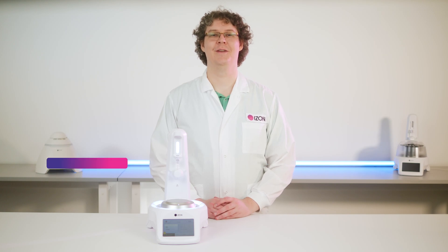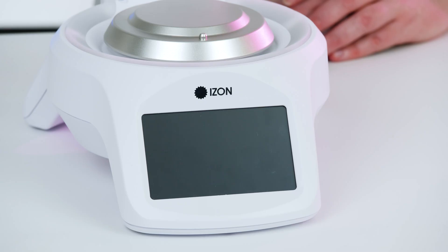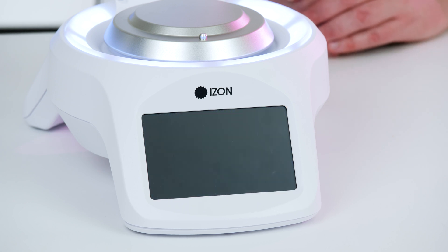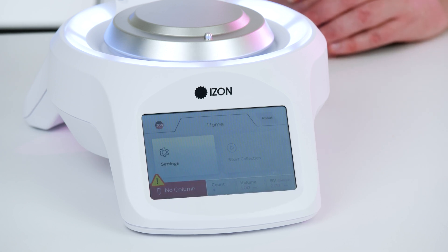Hello everyone, my name is Struhan and I'm a scientist at Izon Science. Today I'll be demonstrating how to set up your AFC V2. First, plug in and switch on the AFC at the rear. The settings menu is always available even without a column loaded.